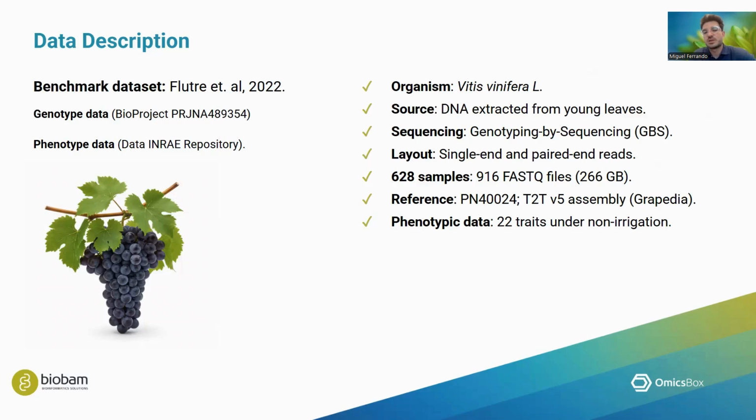The reference genome that we will use is the latest version, the telomere-to-telomere V5 assembly from Grapevine Genomics Encyclopedia, and the phenotypic data has been curated to include only a subset of traits under the same conditions.